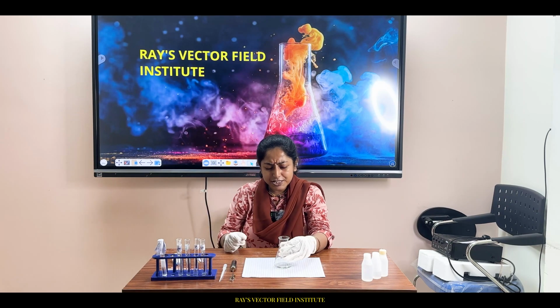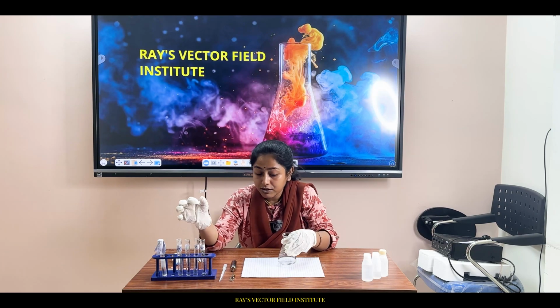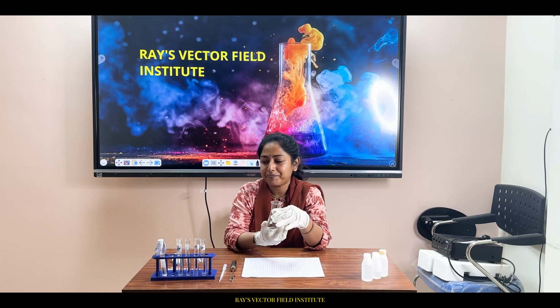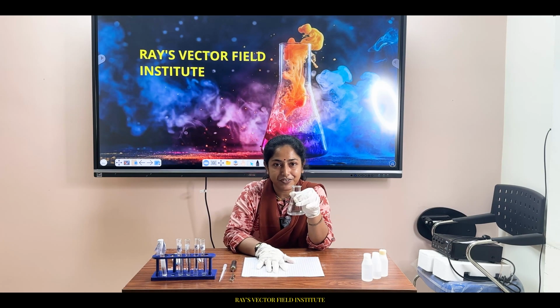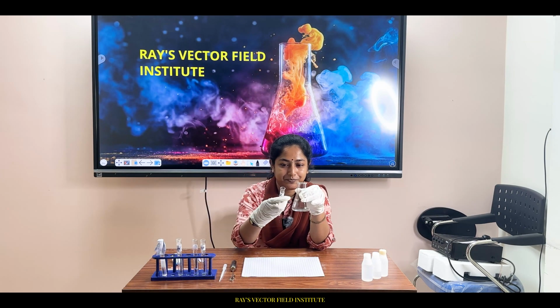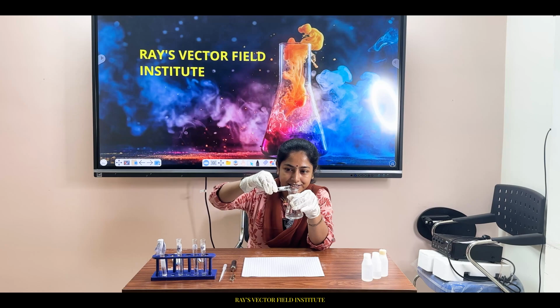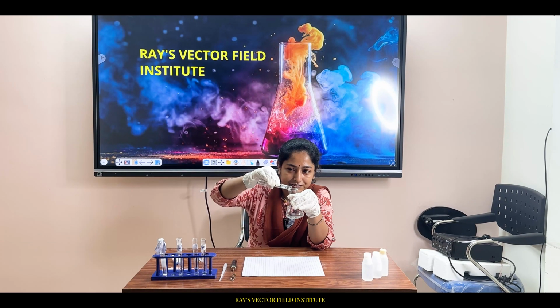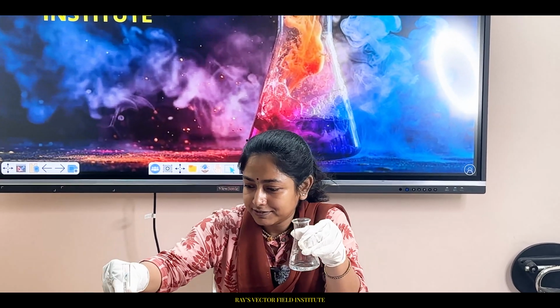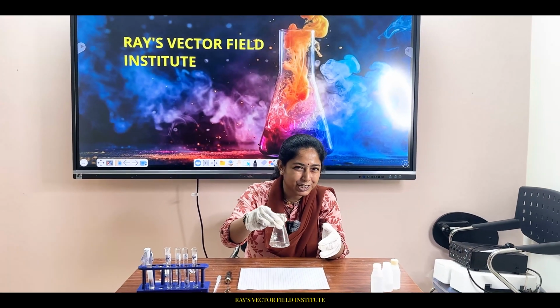Let's begin. Here I have taken distilled water. What is the name of this equipment? Can anyone tell me? It is a conical flask, and here I will show you the titration. Let us take X, a colorless liquid. Let's take some drops of it, very carefully. Let's stir it to dilute it a little bit.